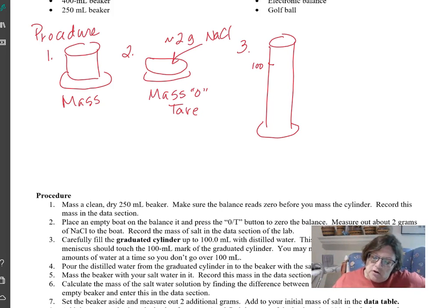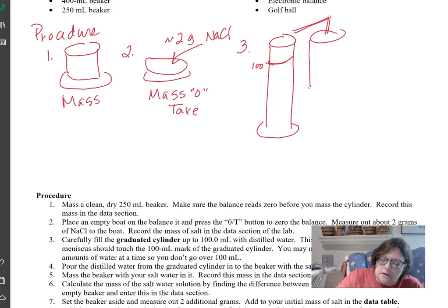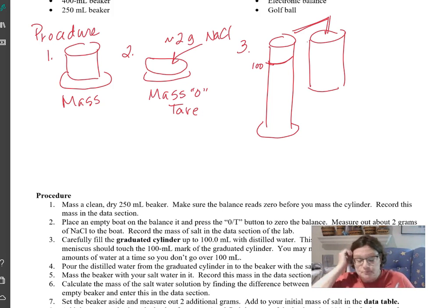All right, so you're going to fill it up to the 100 milliliter mark. We want the bottom of the meniscus on 100. Now, this is hard to do. The wash bottles have, like, dropper, kind of like eyedroppers on the end. So you can add small amounts, but if you need a pipette, we've got pipettes. You can use a pipette to either add a little more water or take a little away, and that is how we will get that to exactly 100.0 milliliters. Okay.